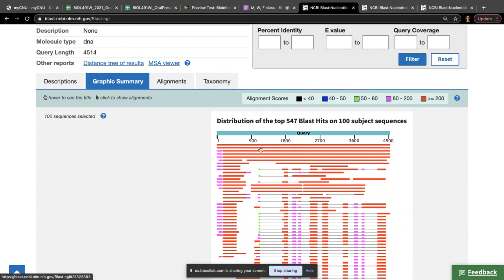And then you could argue, okay, but how about everything else? Okay, those are sequences that also matched that. And let's pretend I didn't have the first or the second or even third and fourth lines or fifth. So let's say this one. If I look at this result, I would say this looks like 2 genes. So one gene here and then another gene here.